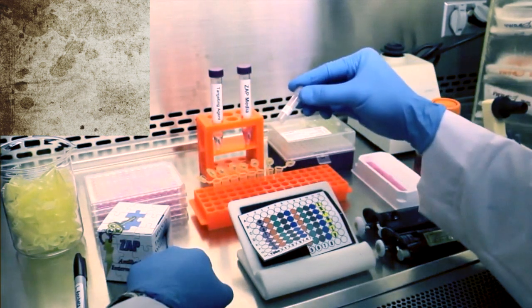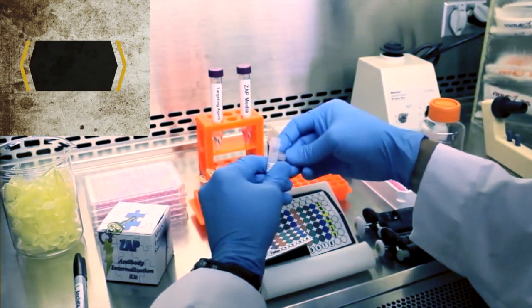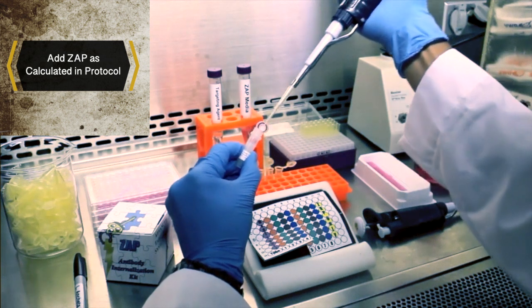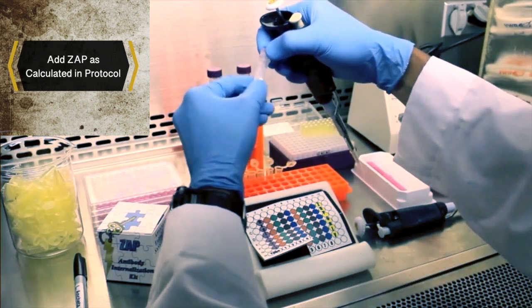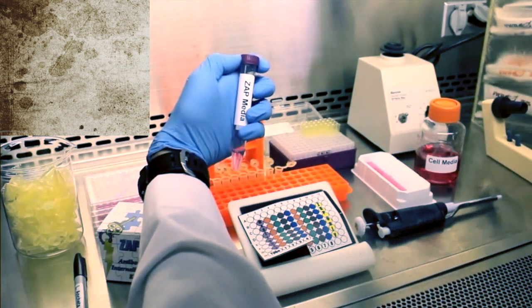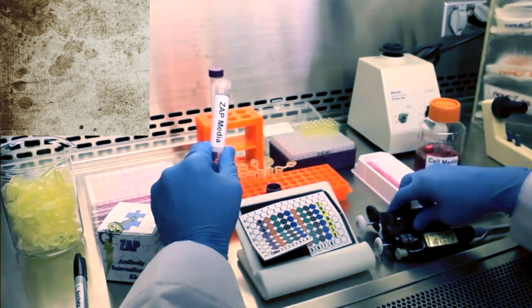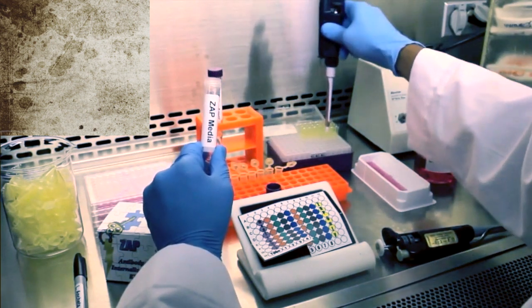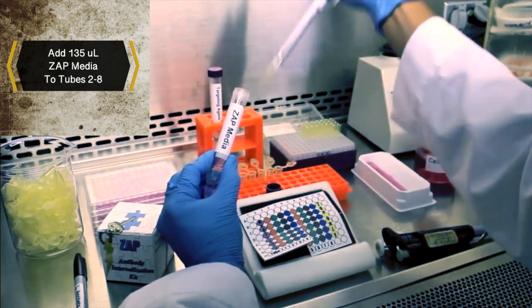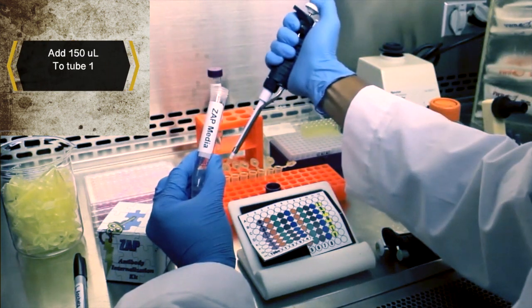Then, briefly vortex the ZAP product vial and transfer the volume which was calculated according to the PDF instructions. Briefly vortex. Then, transfer 135 microliters of the ZAP media solution into tubes 2 through 8. Now, transfer 150 microliters to tube number 1.